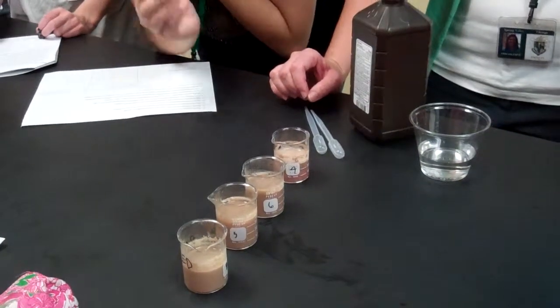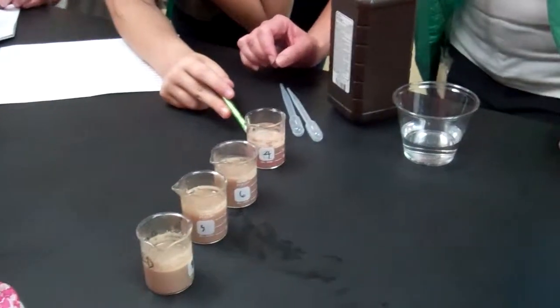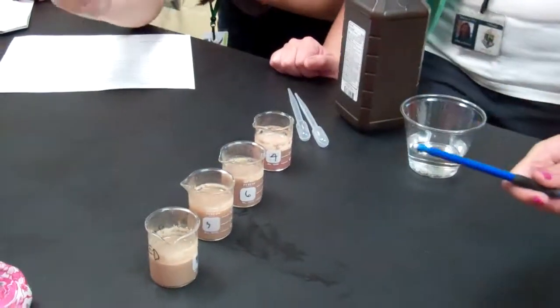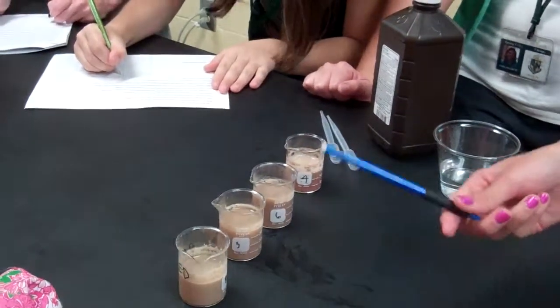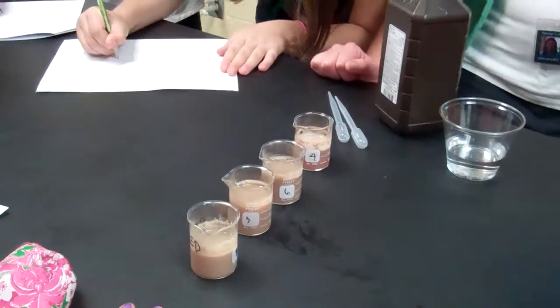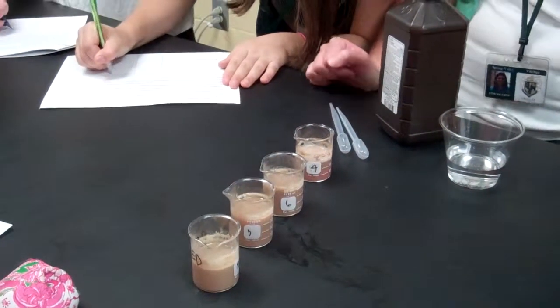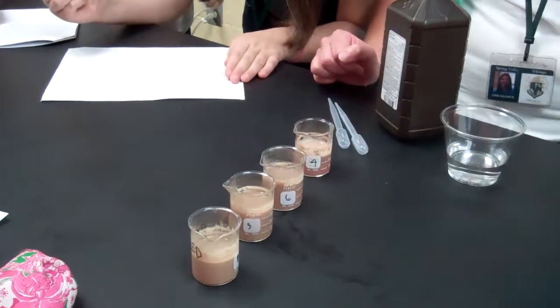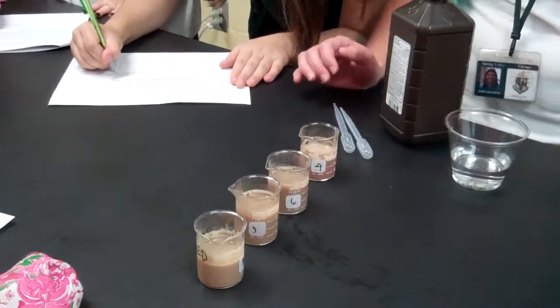Little pebbles. What are those little dots? It looks like from the meat of it, it's starting to separate again. Raw, base, acid, boiled. Base is a darker brown, and acid's very liquidy, and then the boiled one is beige.